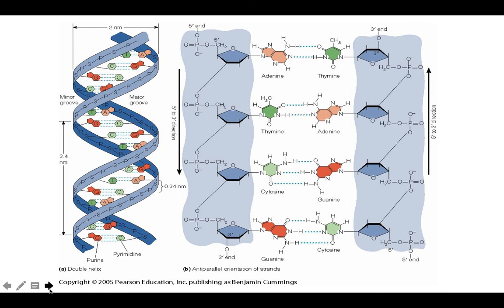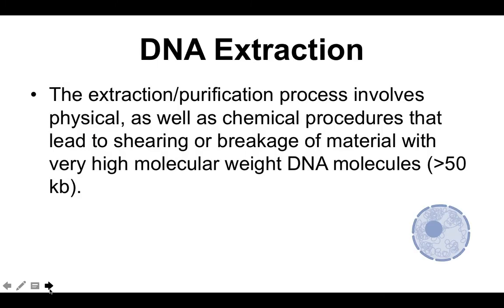Now we proceed to the highlight of our laboratory activity. We want to isolate DNA from a living organism, in particular, medicinal plants that are recognized and endorsed by our Philippine Department of Health. It is important to take note of the key principles or ideas in DNA extraction.